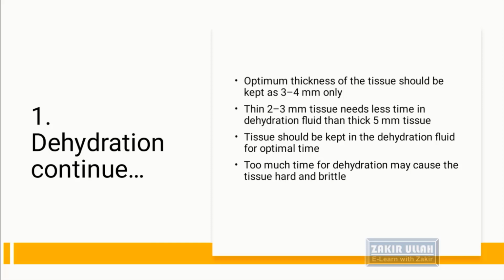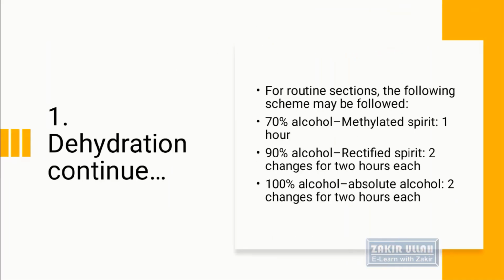Time management for a tissue is important, because when we give too much time in dehydration fluid, the tissue may become hardened and brittle, or when we give a short or insufficient time, the dehydration process will be incomplete and water may be retained in the tissue. So this should be noticed.